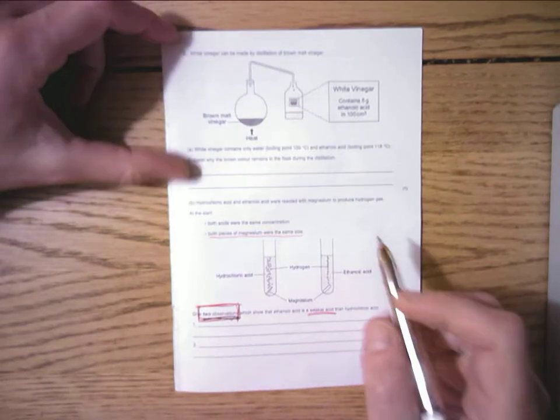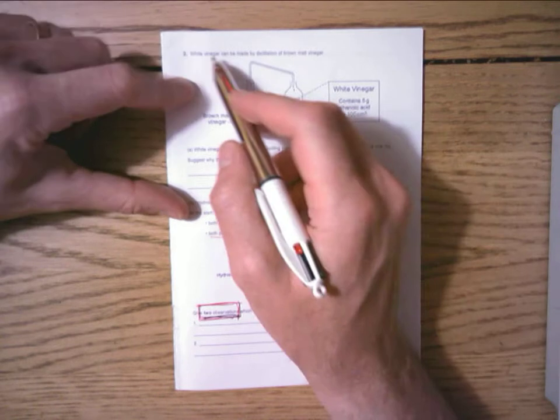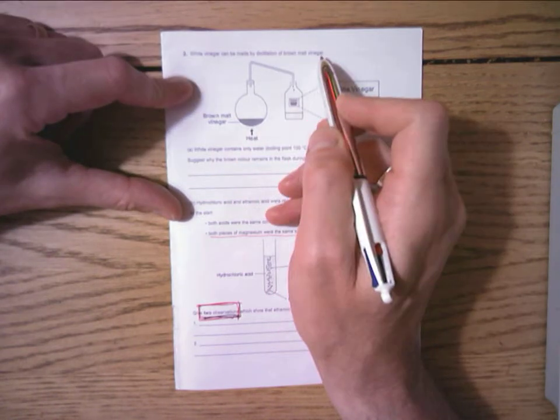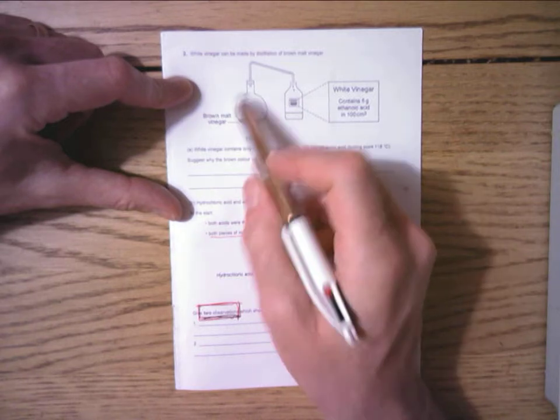Right, welcome to question 2 of the Year 9 Acids, Reactions of Acids test. White vinegar can be made by distillation of brown malt vinegar. Here's the brown malt vinegar. We're going to heat it in a round bottom flask.